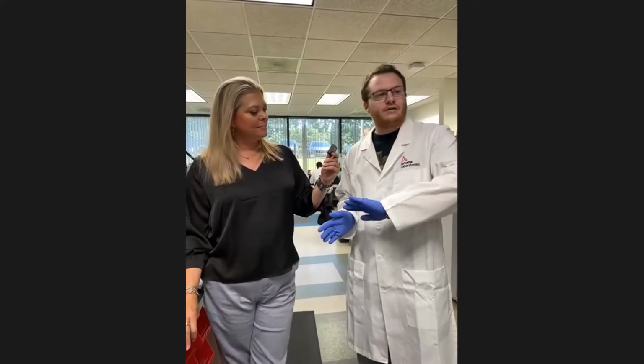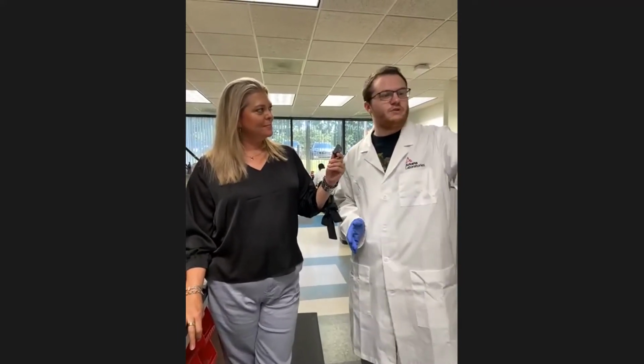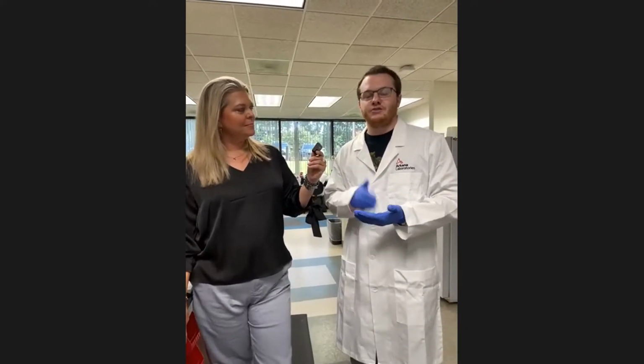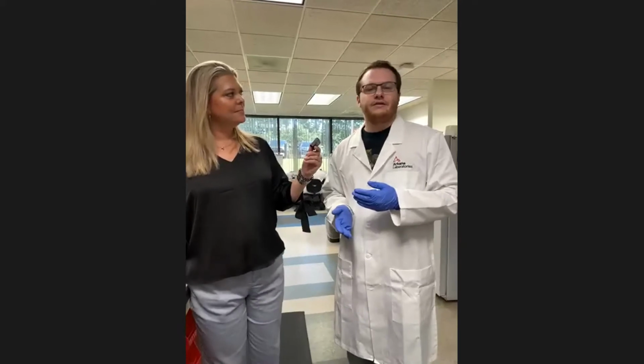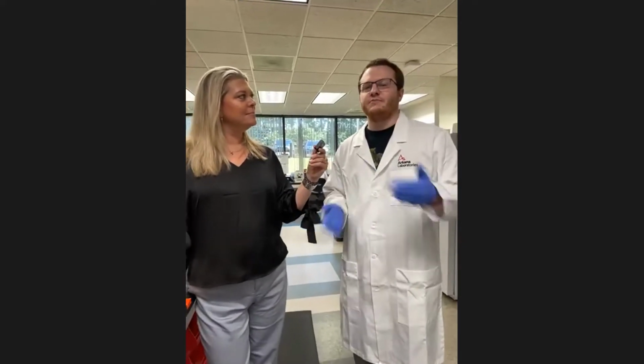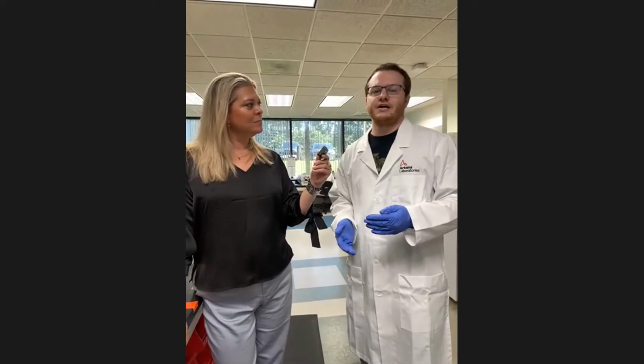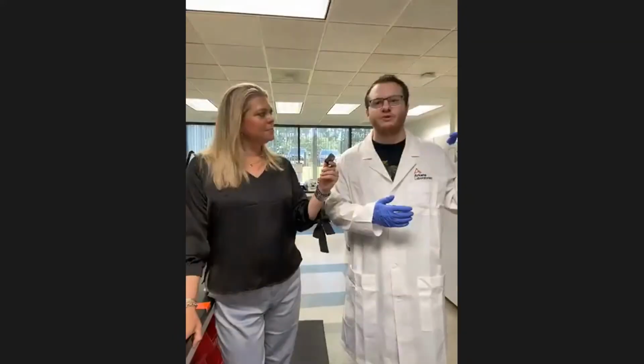But other than that, we keep the East Coast going first, and then we send them through our system. We assign each patient an internal case number, and again, make sure everything matches up the entire time. Then we hand it off to our grosser, and we can have up to 10 grossers grossing at one time. The grosser takes the case, both of the bottles, back to one of the 10 grossing stations.